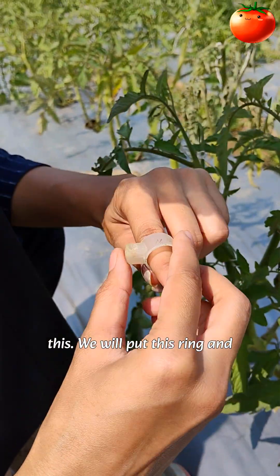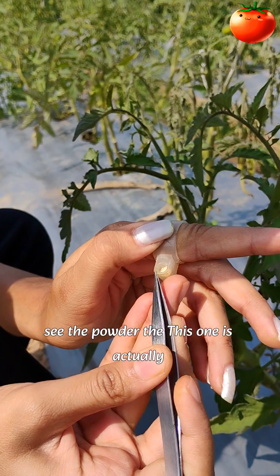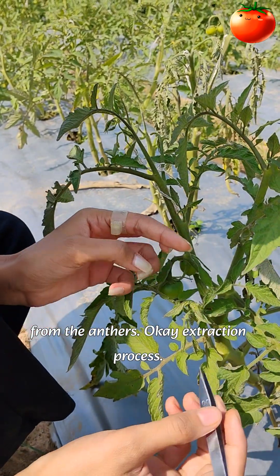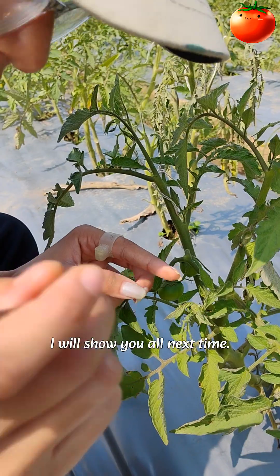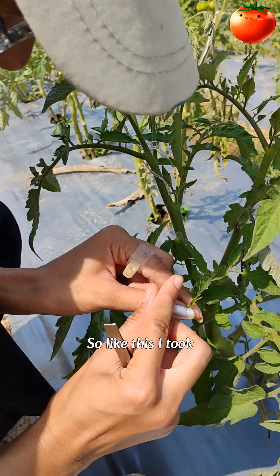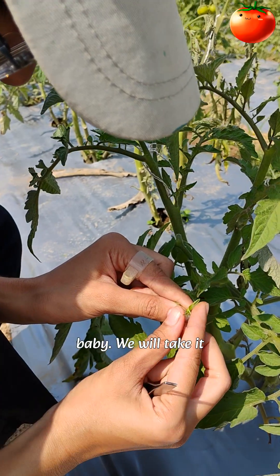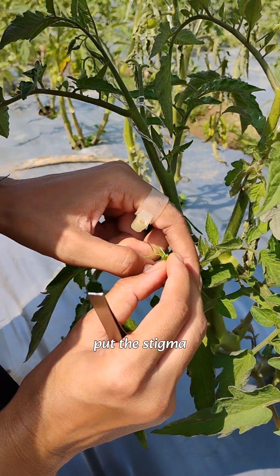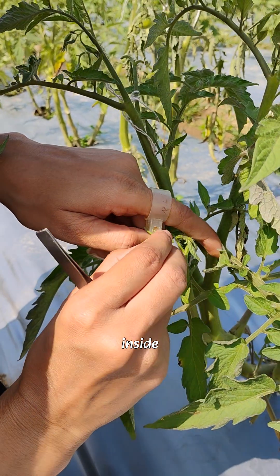For pollination, we will use this ring — see this ring, see the powder. This is actually the pollen that we have extracted from the anthers. The extraction process I will show you all next time. Just like feeding our baby, we take it like this and put the stigma inside the pollen cup.